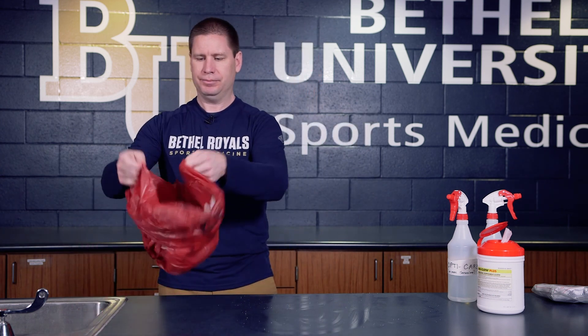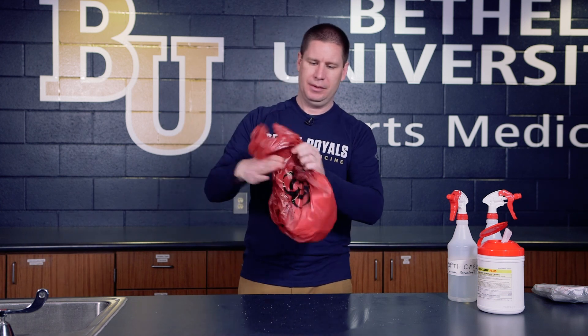Once that's done, go ahead and take your gloves off — that's a separate skill you can watch a video for. Once those are up and in, the bag can be cinched up tight, everything is cleaned and disinfected, and you're ready to go.